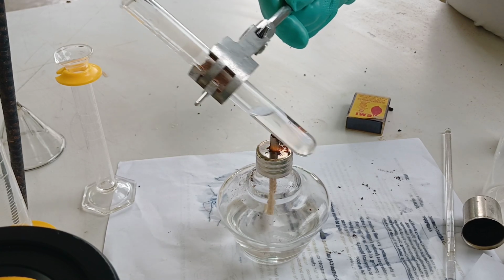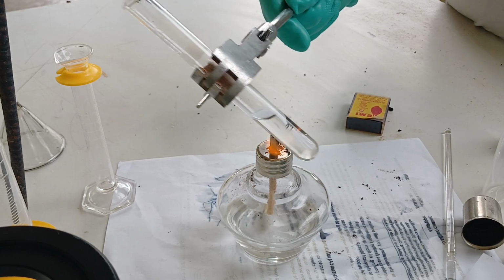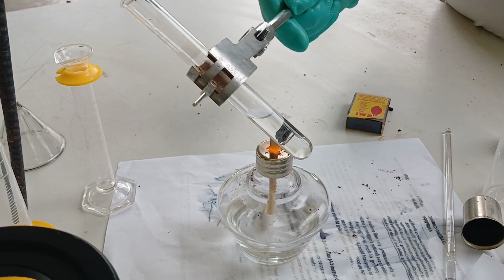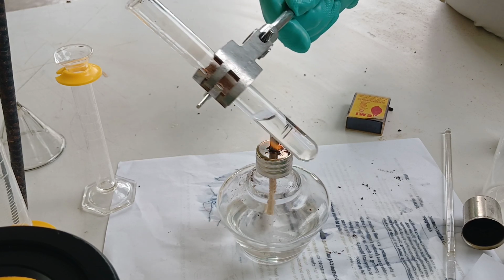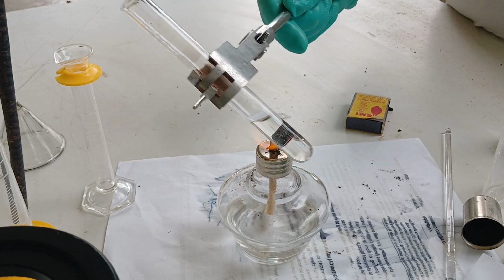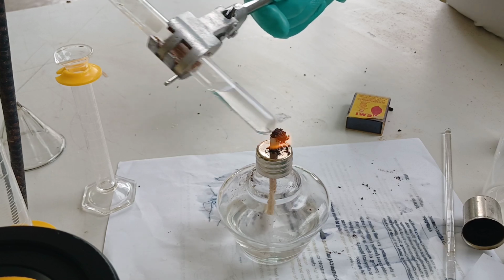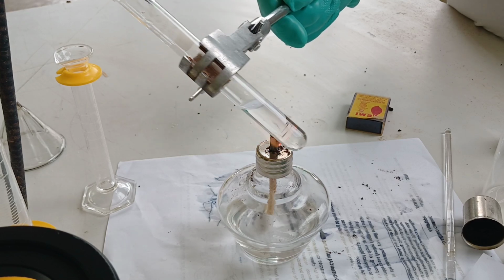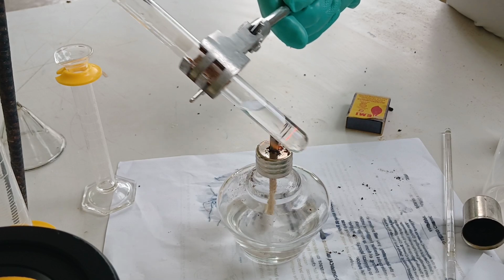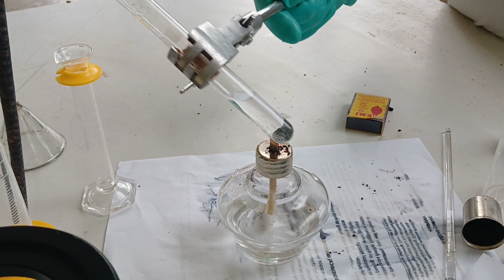If you could see the projection of your experiment, the open mouth of the test tube is pointing to no one else. So never ever point the open mouth of the test tube to anybody else, including yourself. The reason: if there's any splashing, the liquid will burst out from the test tube. If there's no one there, then you could prevent an accident. So that's the best technique.